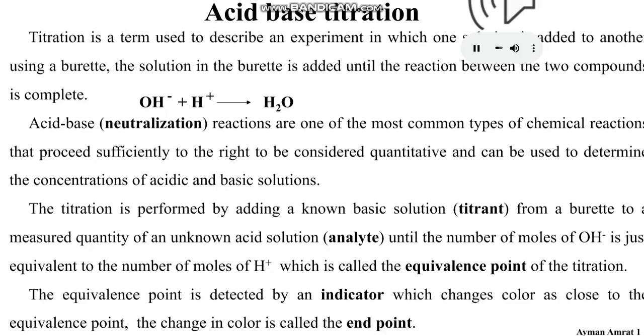Titration is an analytical technique used to determine the concentration of one solution that is added to another using a burette. The solution in the burette is added until the reaction between the two compounds is complete. An example of a titration reaction is the acid-base, or sometimes called neutralization, reaction.